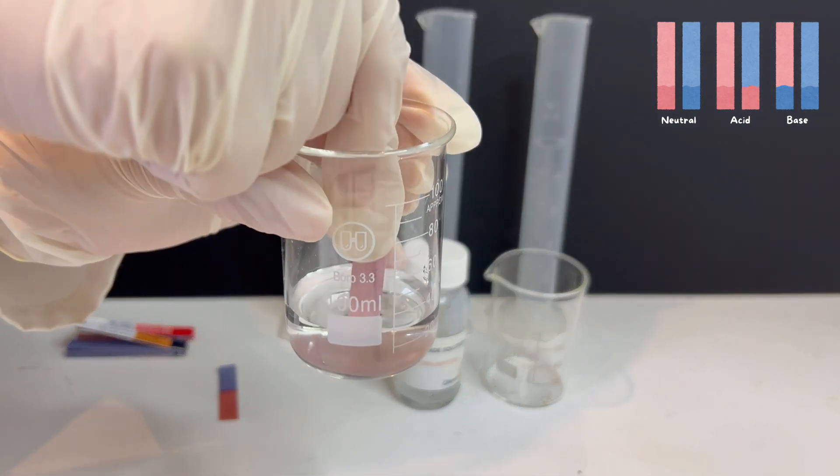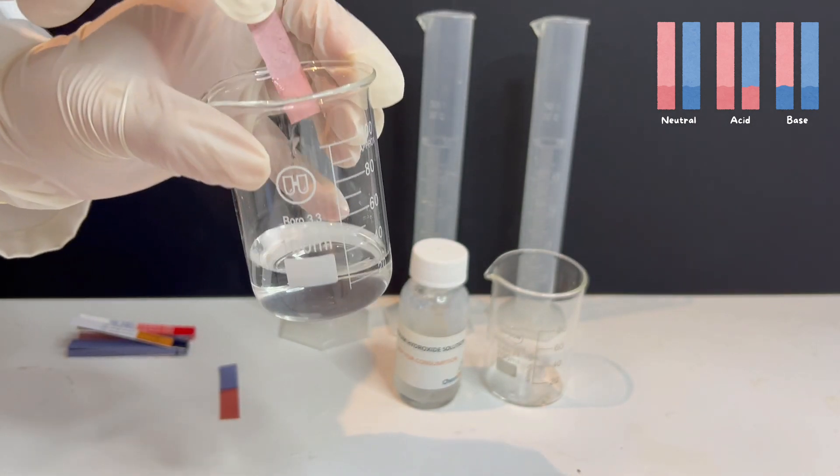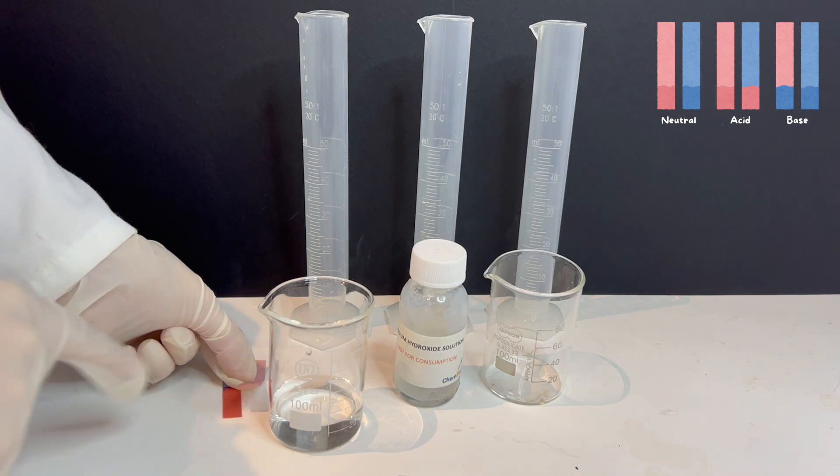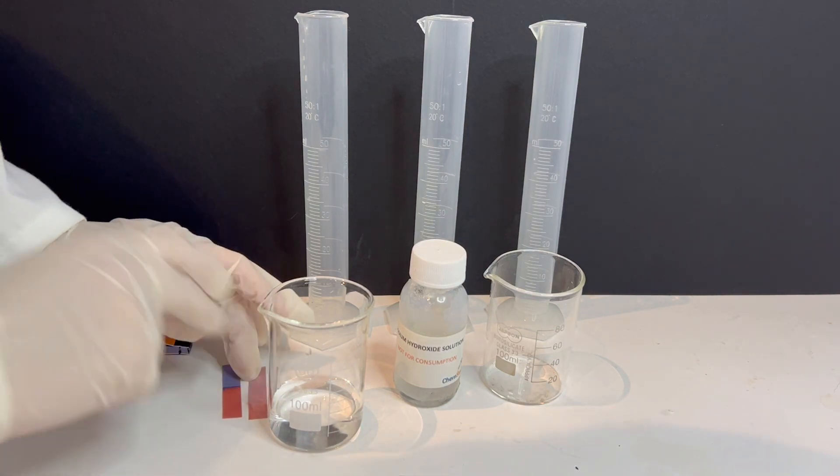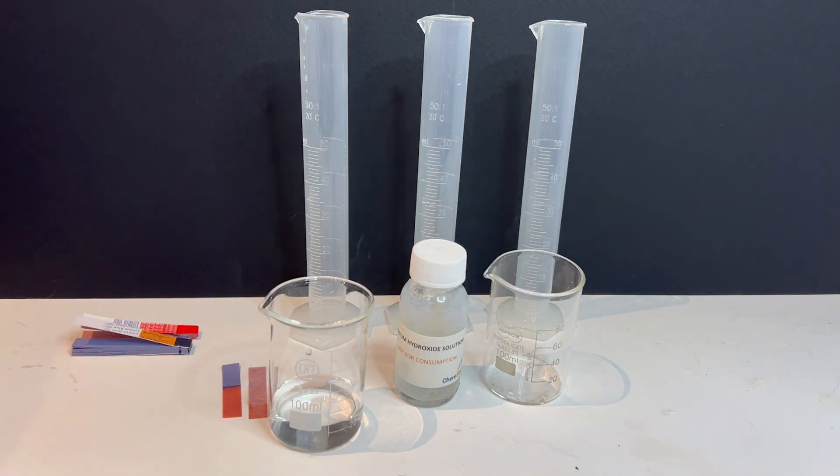Now, I will test the red litmus paper. I dip the red strip into the same vinegar solution. This time, there is no real color change. It stays red. That's because red litmus already shows the acidic form of the indicator. So acids don't change its color any further.